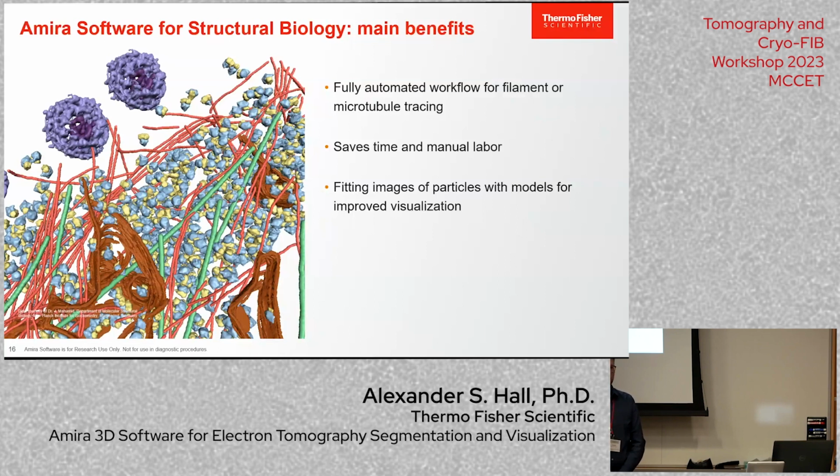Yeah, in terms of the software, there's not a firm limit on the physical size of your data. In software, we talk about how much data it takes in memory. That's a more relevant limitation. When it comes to protein level segmentation, though, often you're going to reach for what's called particle picking, and that currently isn't implemented in Amira. It's been talked about for years and years, but our sentiment is a lot of other programs exist to do it, and they do it very well. And we've just decided not to make it a commercial target.